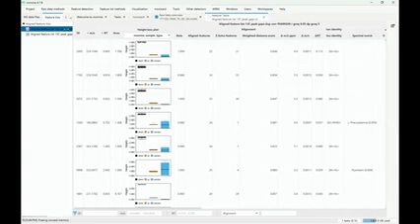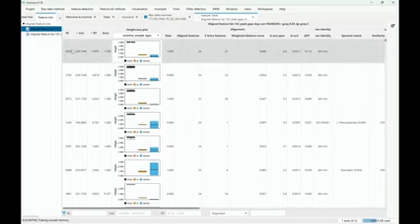And so if you go to the feature list and then double click on the table, it's going to open the table, and on the left, typically you have the ID, which is the row ID from mzmine. All the exports that we do typically have this row ID. And if you develop your own method, if you use GNPS, SIRIUS, any other tool, they typically still retain this ID, and you can merge the results. So you can bring in the results from other tools, and you can merge them in, let's say, Python or Excel. You can always go back and find this was the feature with the retention time, and so on.